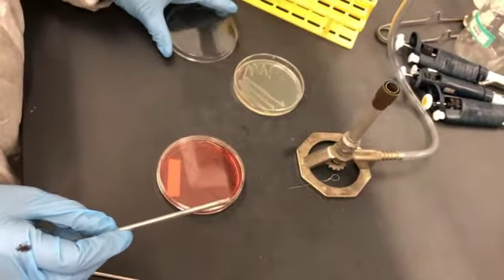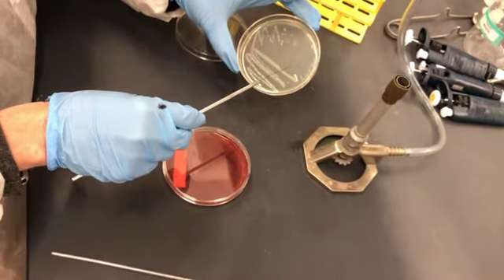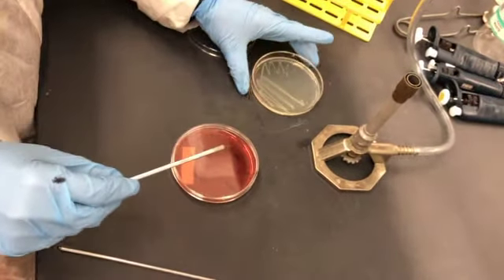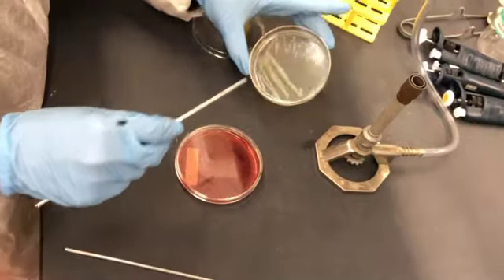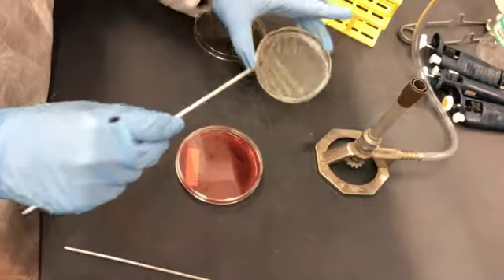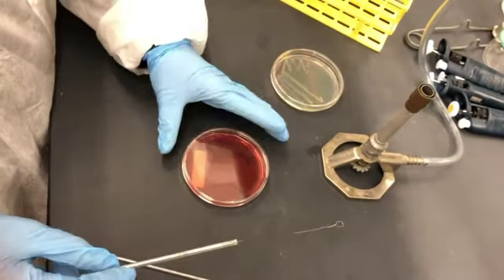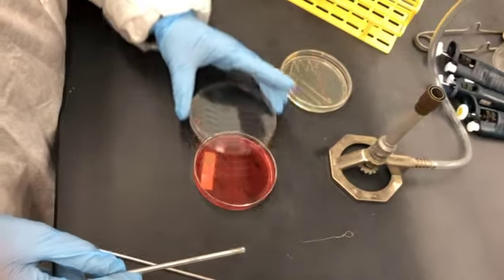And one thing that should be a focus is that you don't want the bacteria from one quadrant to move into and contaminate another quadrant. So I tend to do small zigzags so that I can ensure the bacteria grows separately.